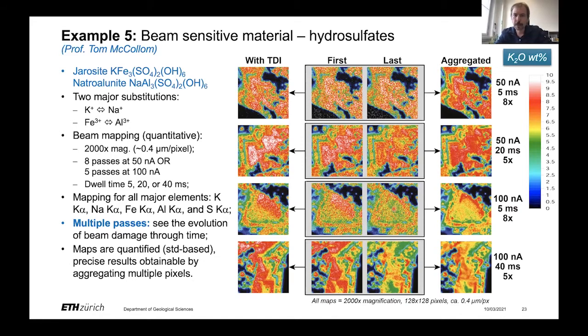And it's not simply just diffusion, but it seems that some zones are getting sometimes enriched in that element, sometimes depleted. This is even better seen here on the harshest map, where we have this potassium-rich zone here, which totally vanished here, and we suddenly start having this sink for potassium in this zone.